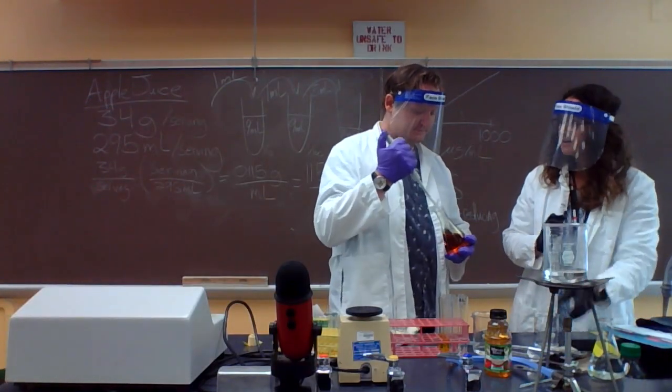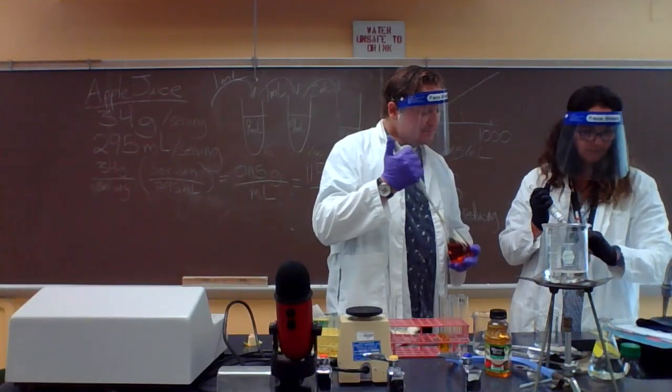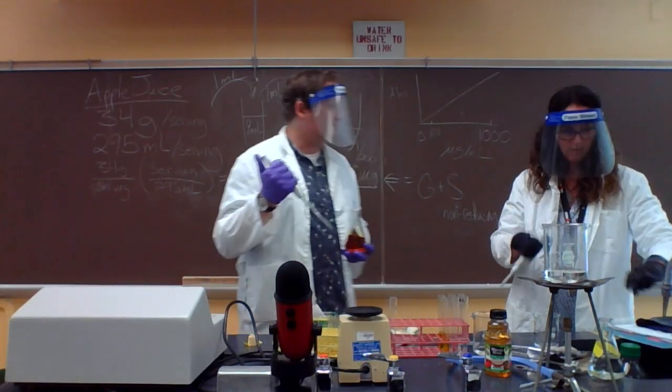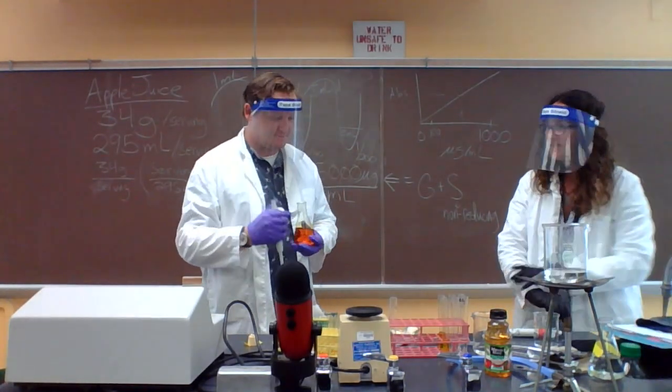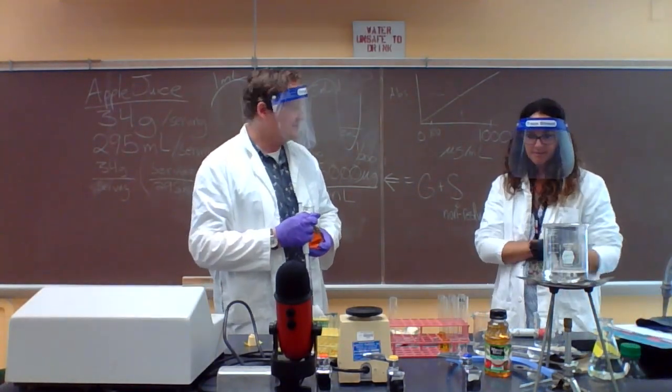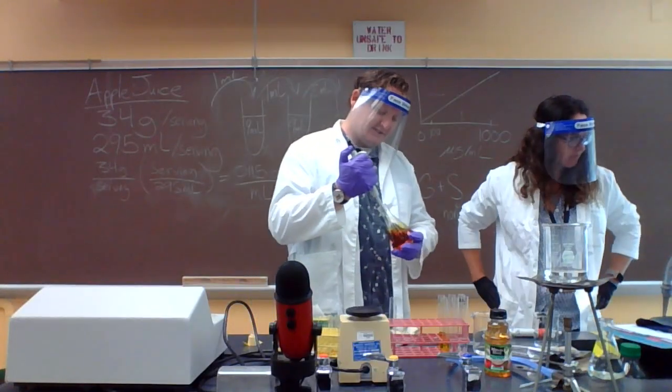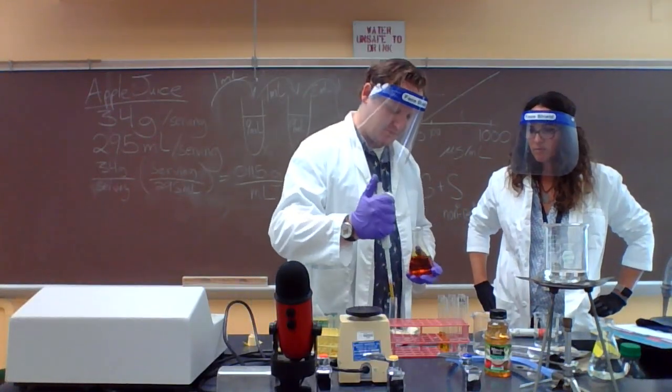Jonathan, are you doing a blank for the spectrophotometer? We've already blanked it for the standard curve. We haven't changed any settings, but we can totally blank it if you'd be comfortable with it. Yeah, I think we should do it again, just in case. Why not? So equal volumes of DNS and water then, right? Yeah. Fantastic. So this will be our blank tube right here.